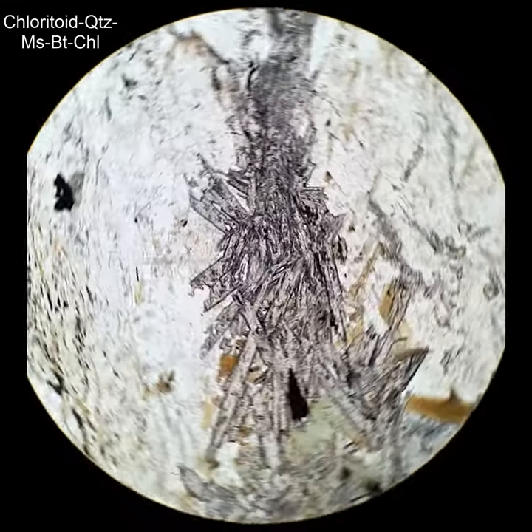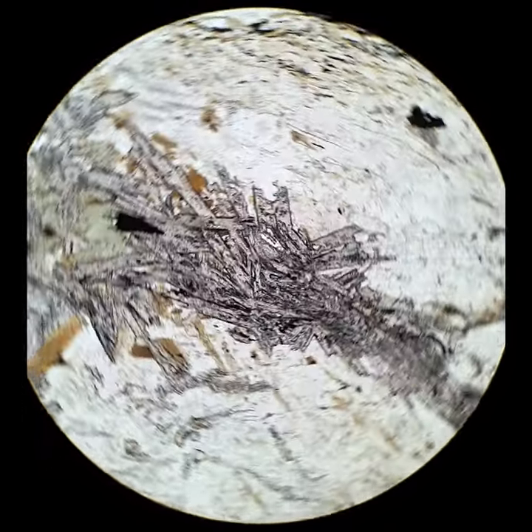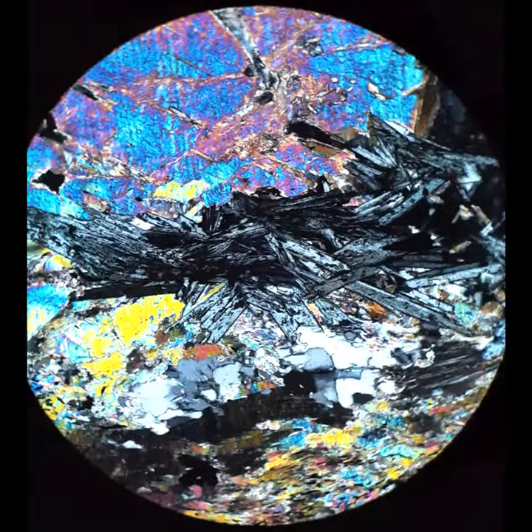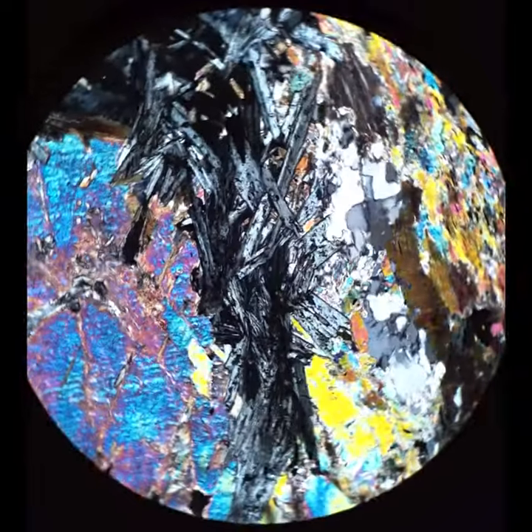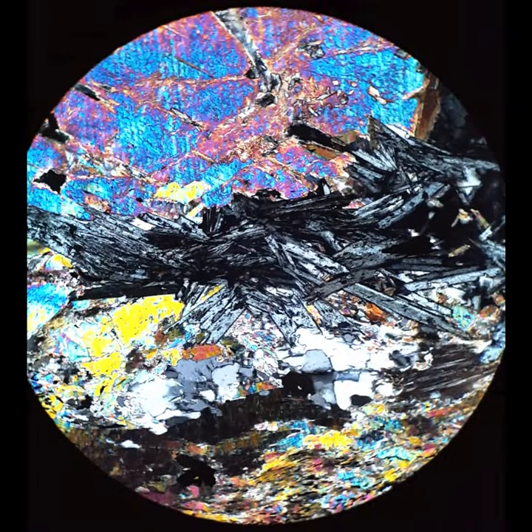Chloritoid can form these mats of crystals. This is a whole clot of them, more or less randomly distributed. You can see some chlorite coming around on the right just now — it has low relief, and it's green. When you cross the polars, chloritoid and chlorite can look a little bit similar; they can have similar interference colors, but the pleochroism and the relief are distinctive.